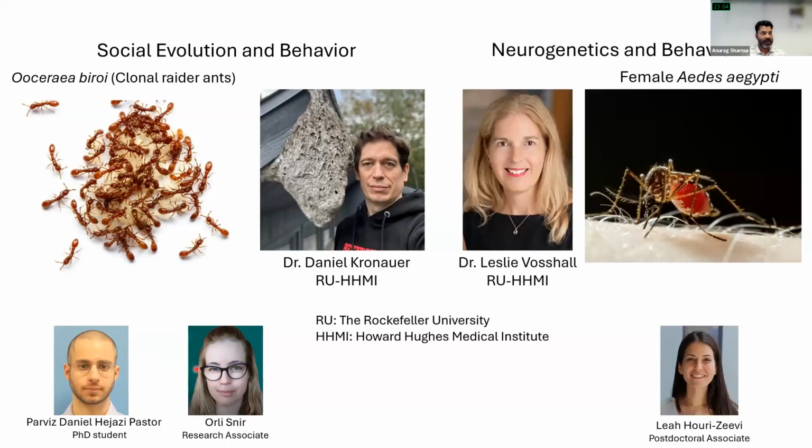And this is another lab, Leslie Vosshall's lab, which works on the Aedes aegypti mosquito, its various life cycle stages and other aspects of the mosquito's life. And Leah is the postdoc from the Vosshall lab, who collaborates with us to do scanning electron microscopy and TEM to find the answer to the research she is pursuing.